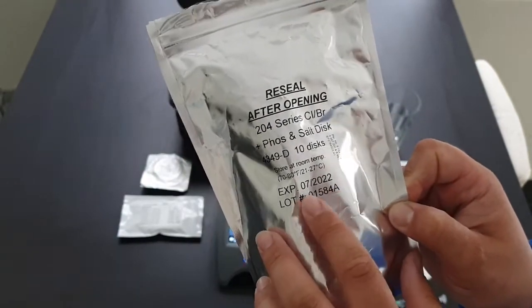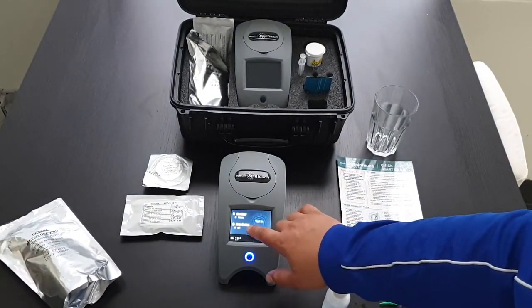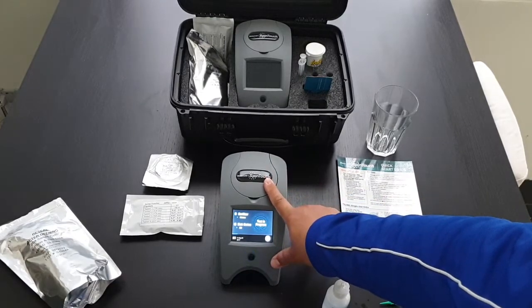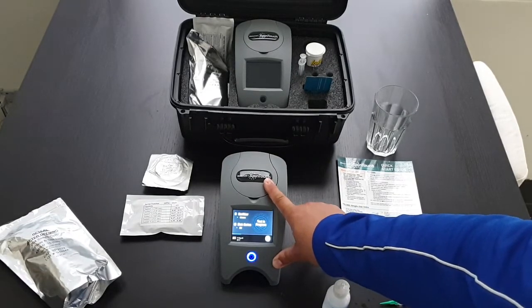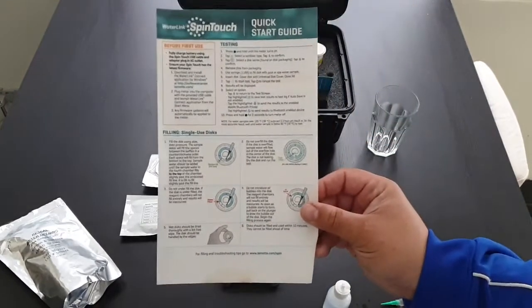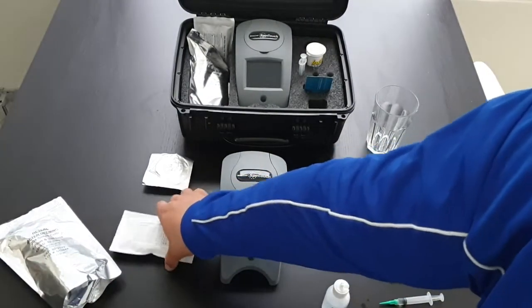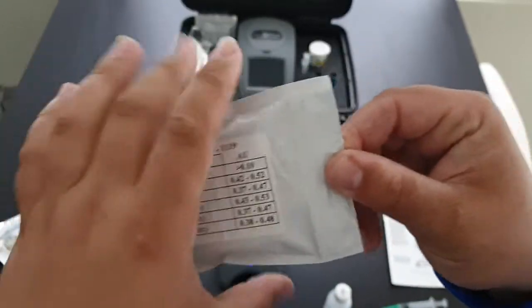You want to make sure that the discs are in date. Tap to start. They spin pretty hard at first and then slow down. Each spin lab kit has all the instructions which are pretty simple to follow.